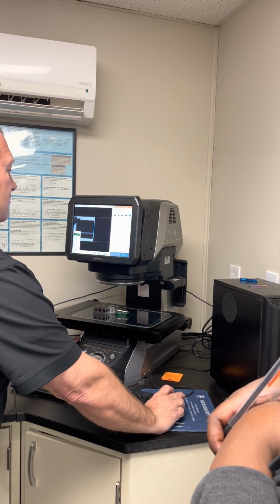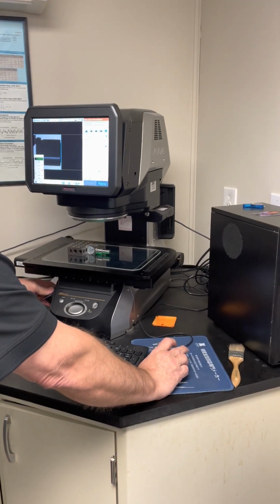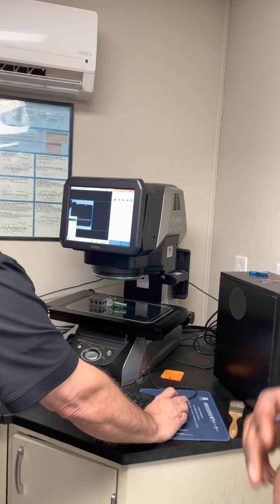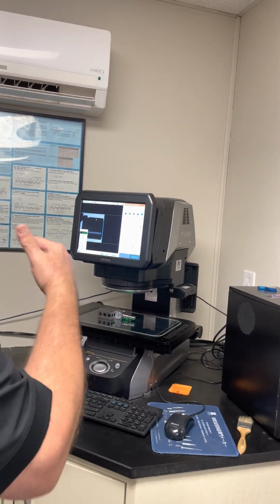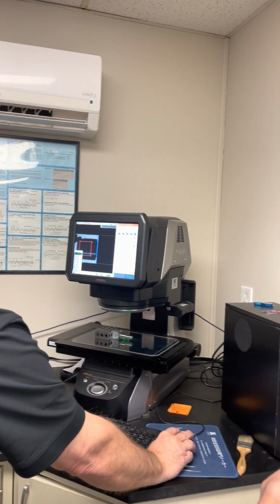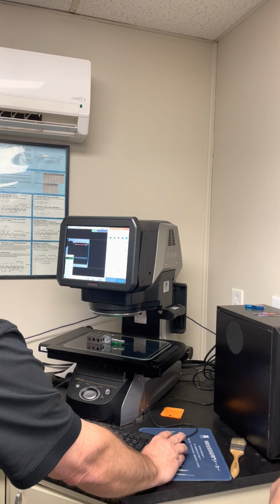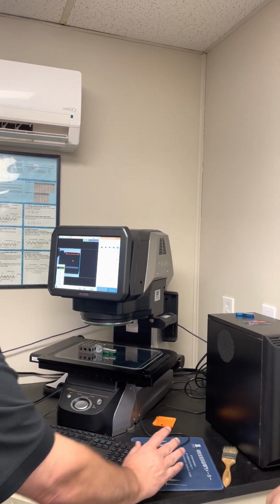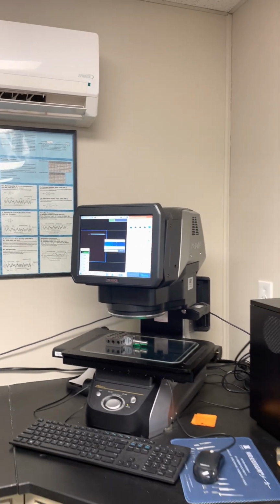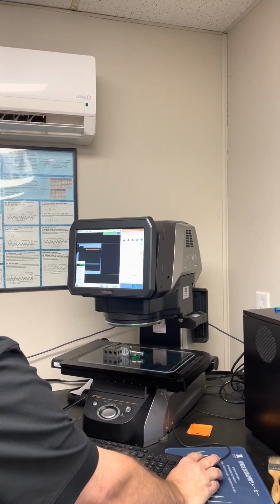Now, what I like to do, it doesn't matter, but I like to come in here and manually focus a little bit. Get it fairly in focus. And then from here, I clicked on the scale here, and now I'm just going to put it here, and I'm going to say this is the area that I want to focus in on. So now I'm going to do an autofocus. Okay. Now I'm going to hit capture.